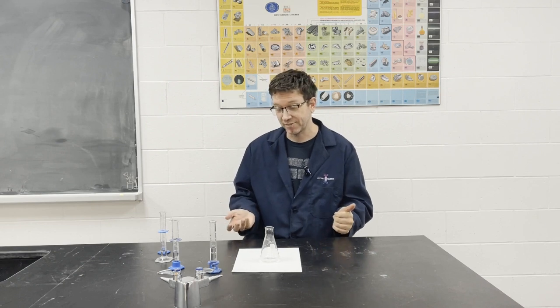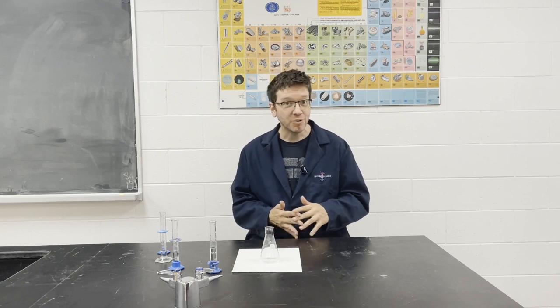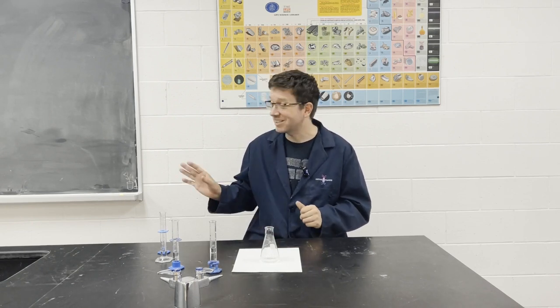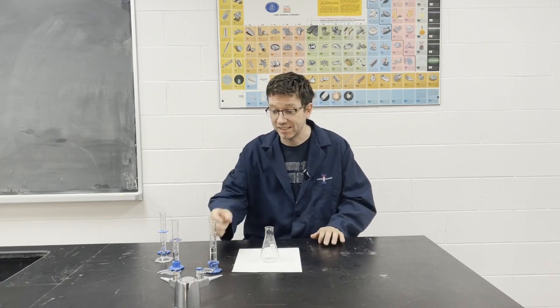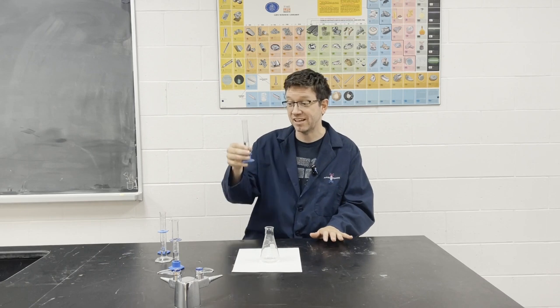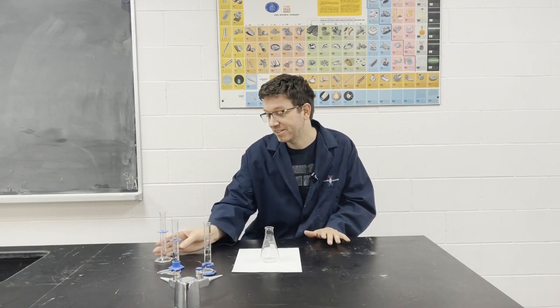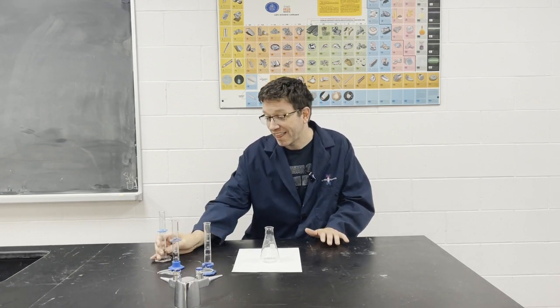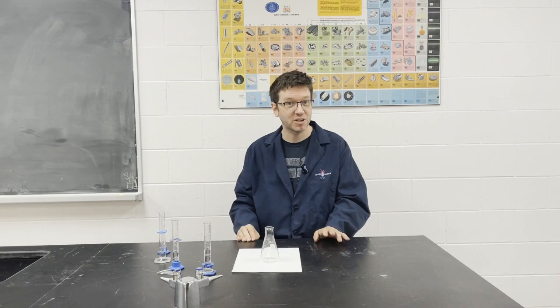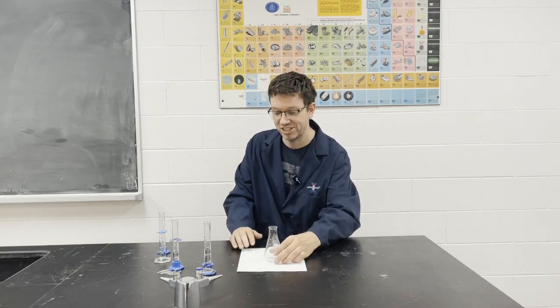All right, in our next test, we are going to be testing how different concentrations affect the rate of reactions. I'm going to first start with a higher concentration of sulfuric acid, and then we'll test a lower concentration. And how we're going to do that is I'm going to use the same 0.5 molar sulfuric acid, but instead of preparing 10 milliliters, I've prepared 15 milliliters. And instead of having 10 milliliters of distilled water, I have 5 milliliters of distilled water. So that is how I am increasing the concentration. So let's look at how our rate of reaction has changed.